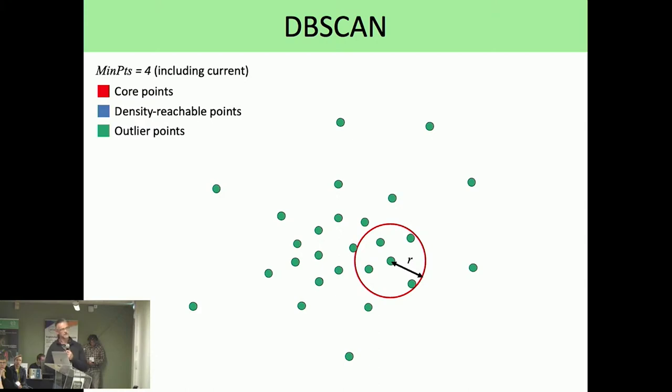And then you have three groups of molecules. You need to classify your molecules based on that. And you will say, okay, if my number of molecules in the given radius is greater than or equal to 4, then it is part of a cluster. So then you can say, okay, this molecule has 5 molecules, that's part of a cluster.